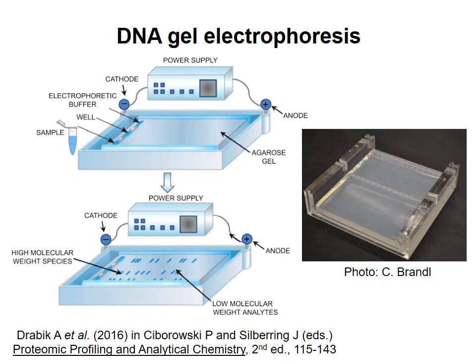The RNA in your RNA prep will contain all of the messenger RNA from the cell. These mRNAs will be of different sizes, and you can separate them by their size using gel electrophoresis. The principle is the same as for the SDS-PAGE technique used to separate proteins by size, except that all RNA is naturally negatively charged because of the phosphates in the backbone. Also, you can denature RNA just by running the gel at a warm temperature — you don't need to add detergent. You can use polyacrylamide to separate RNA and DNA, but often people use gels made of agarose, which is a polysaccharide, and this photo shows an agarose gel.